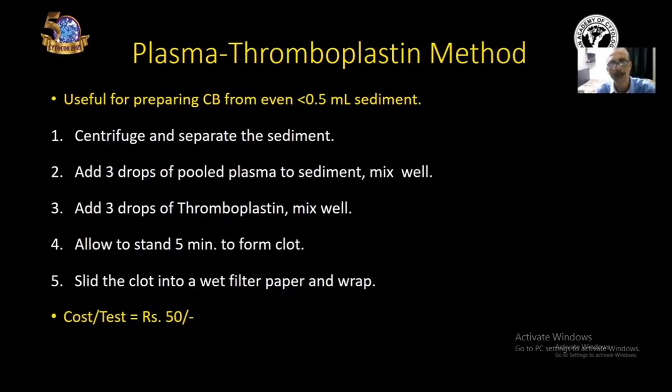Then add 3 drops of thromboplastin, mix well, and allow to stand the material for 5 minutes to form a clot. Last step is to slip the clot into a wet filter paper and wrap it.